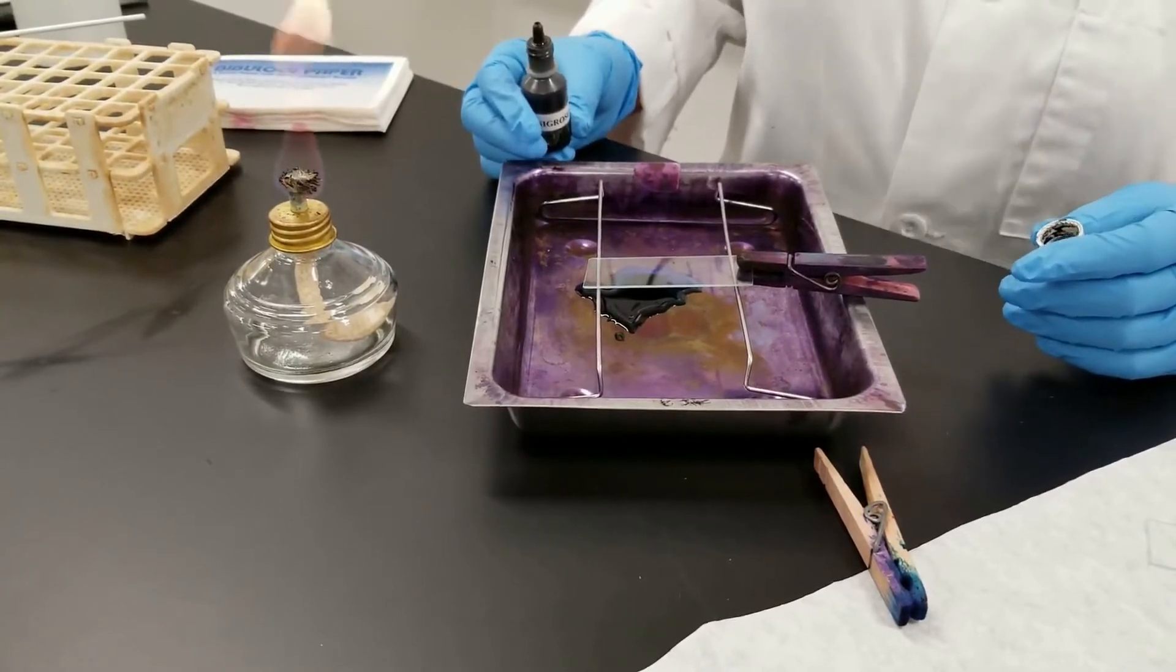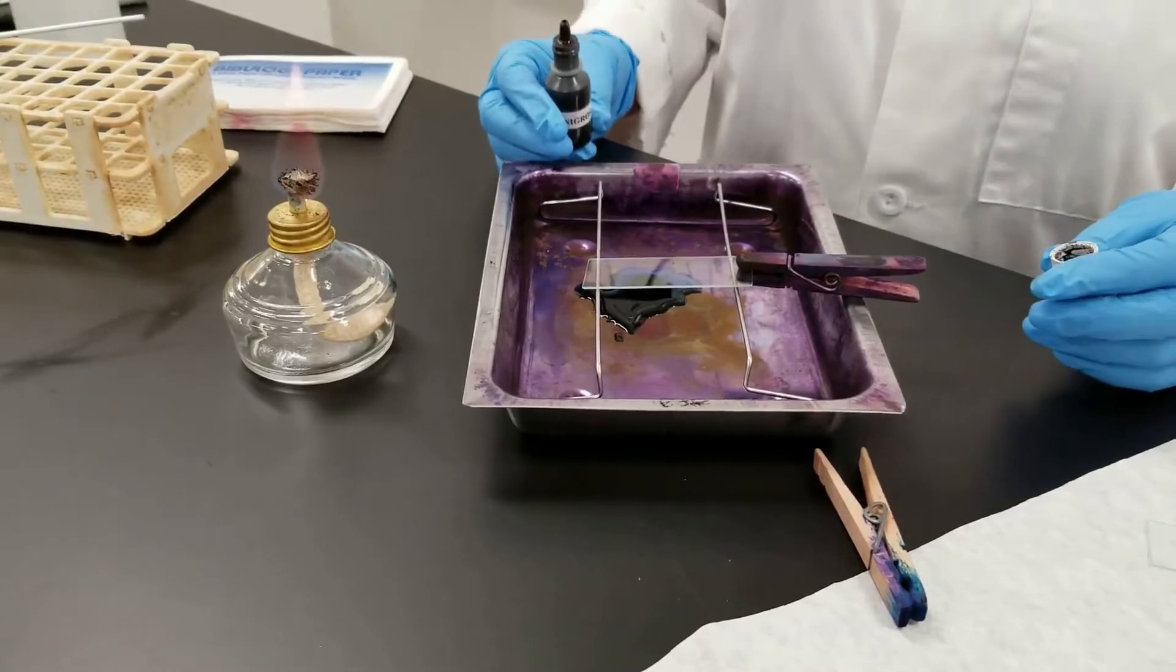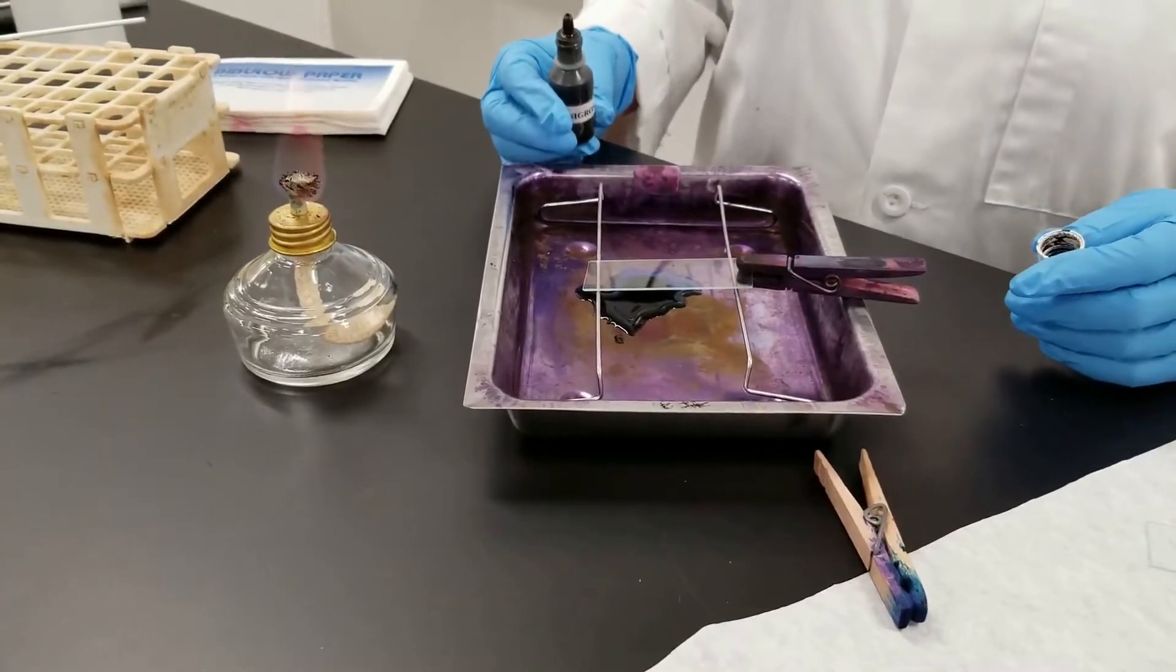The negative stain is different than most of the other stains you're used to in that it will not stain the bacteria, instead it will stain the background.